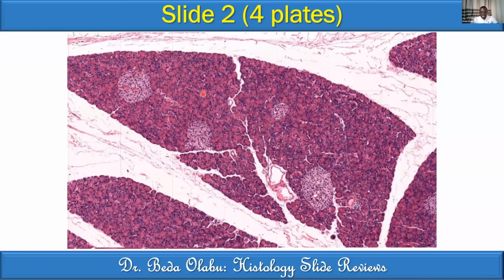But we can see it's serous. Now, what I don't agree with both speakers is how they have described these other things here. These are not mucus acini. Remember, acini will have nuclei in the periphery and a lumen that may be obliterated.